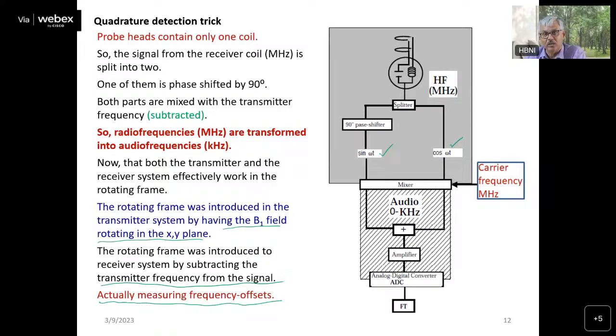Your zero frequency will be at the middle of the spectrum. Don't get confused between this zero frequency and your reference, TMS. TMS is given zero value with respect to this. So with respect to TMS, your carrier frequency will be different. We adjust that later on. Okay, so the carrier frequency is this.